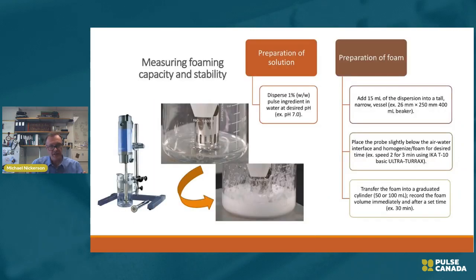So how do we measure this? This is a really quick, dirty measurement, but it gives quite accurate estimates of how well a protein performs as a foaming agent. The first step is, let's create the solution that we're going to foam.